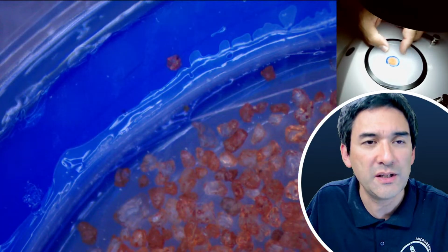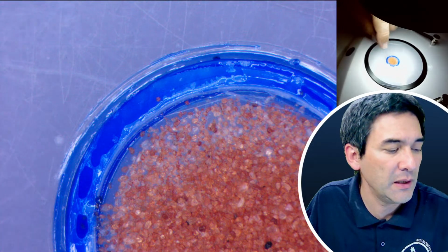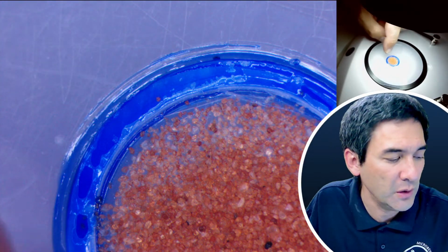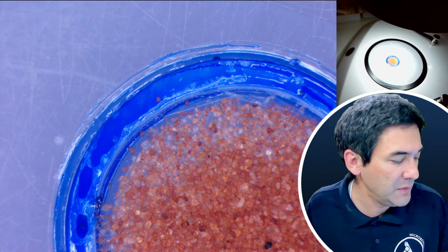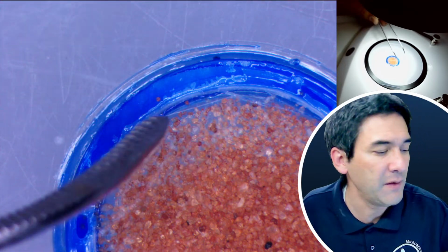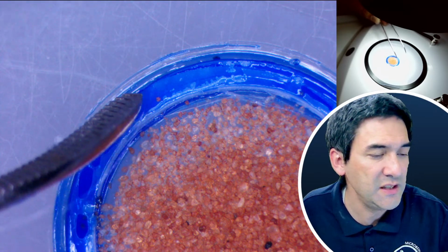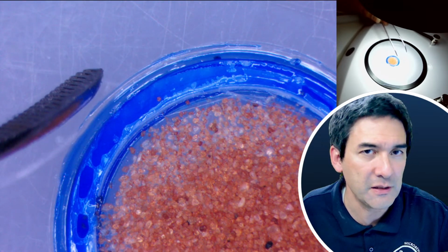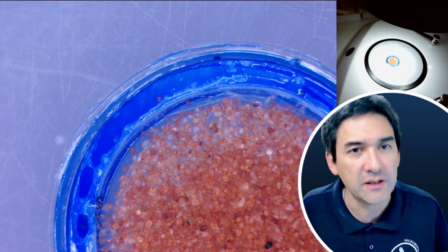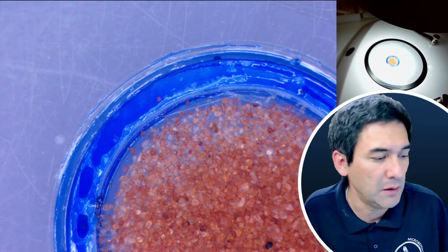So what I'm going to do is I'm just going to leave it as it is now until the nail polish has dried. And then I'm going to, maybe tomorrow or so, apply another ring on the outside. So basically I'm just going to use my tweezers here as a pointer. If I apply another ring of nail polish on the outside, it's going to seal it from the top here all the way down to the microscope slide. And this adds additional stability to this.